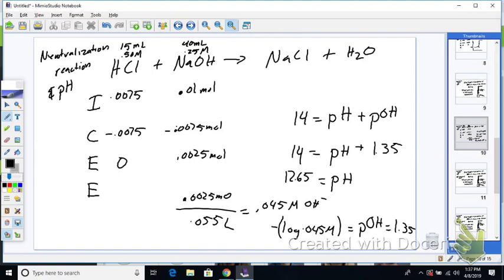Value 1. You take the cap off to expose the probe, and you put it in either the pH 10 or the pH 4 bottle at your desk. At your desk, you have two bottles, a pH 4 and a pH 10. It doesn't matter the order you put them in. Just put it right in there.